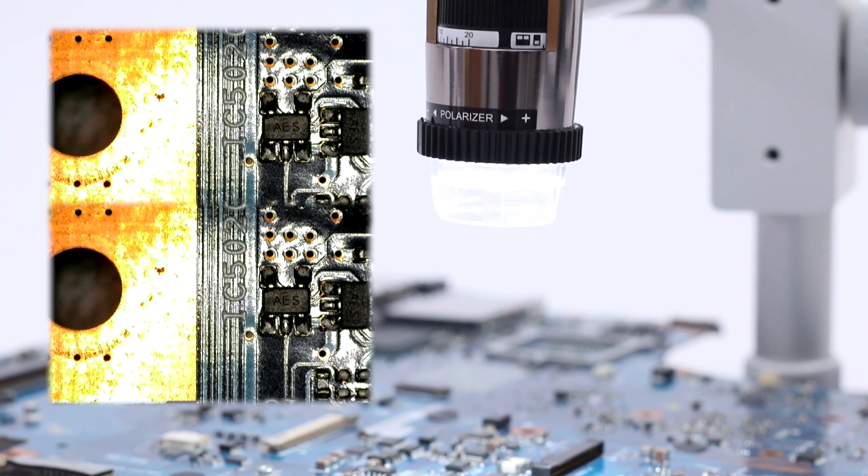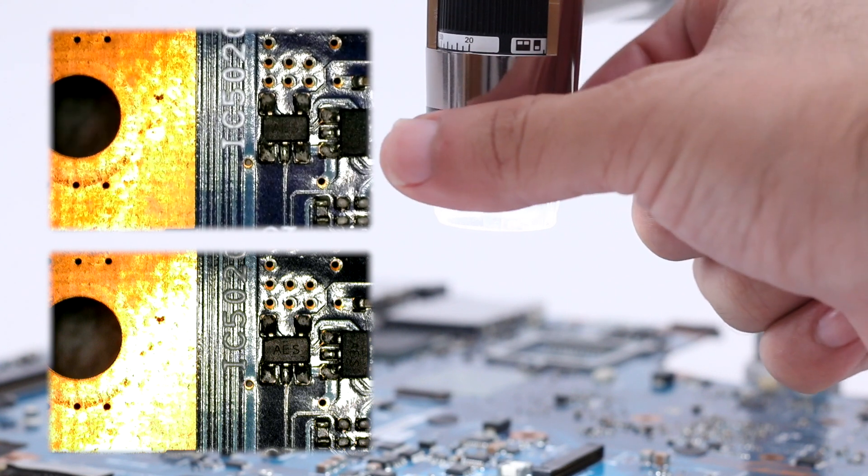Built-in cross polarization helps cut through the glare, giving us an improved view.